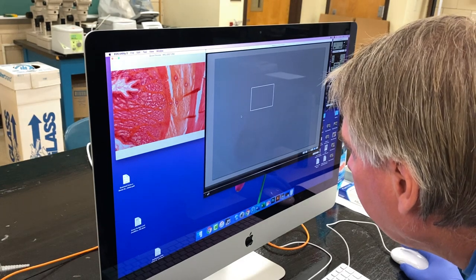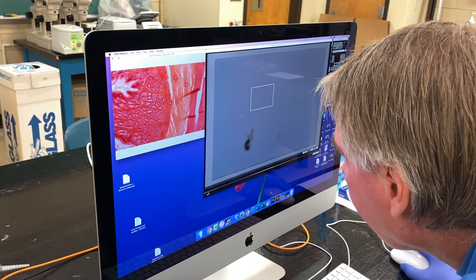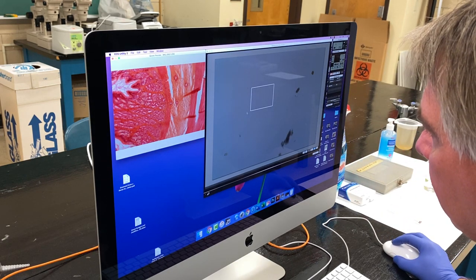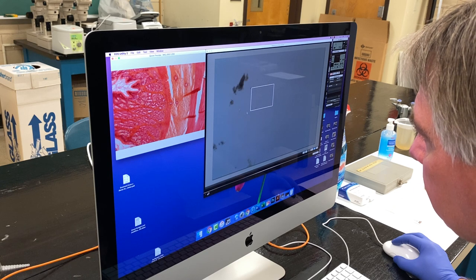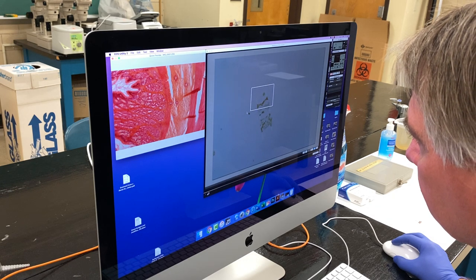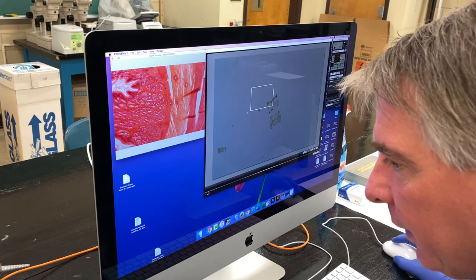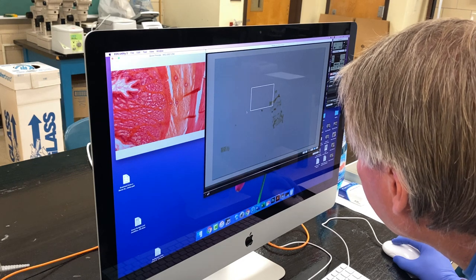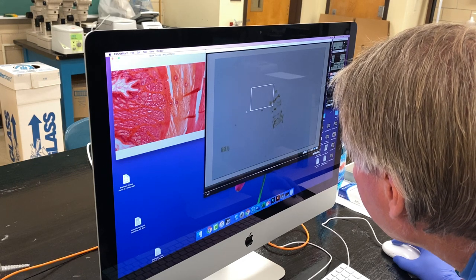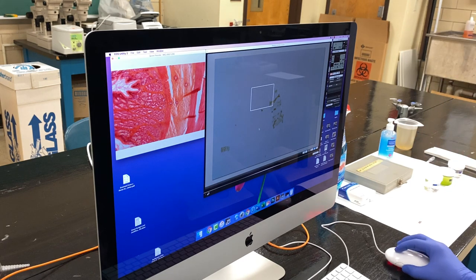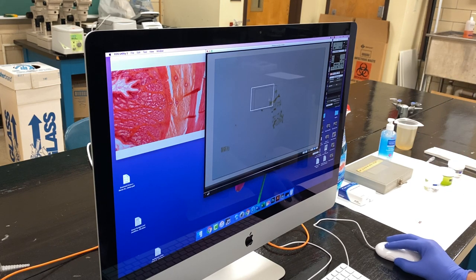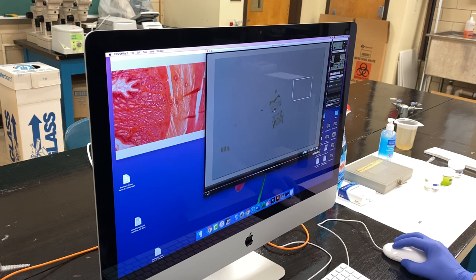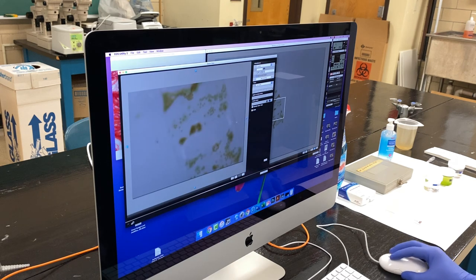I found something — here's a critter. I'll try to center it and focus it. If I want to zoom in, I move the square around, or simply double-click on the object and the square moves into place and opens the zoom view window. I'll use the fine focus to focus the sample as best I can.